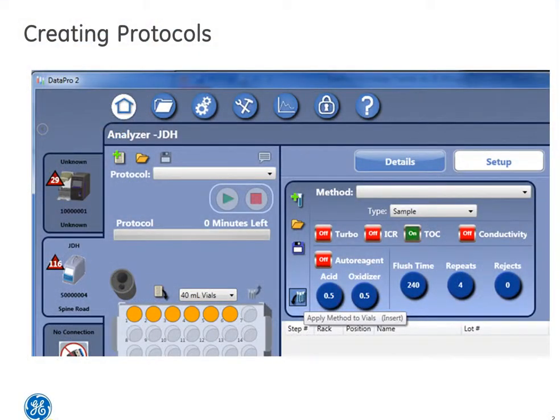From the home screen, you will need to select one or a set of vials. The orange vials from the auto-sampler field are the vials selected for this unique protocol.